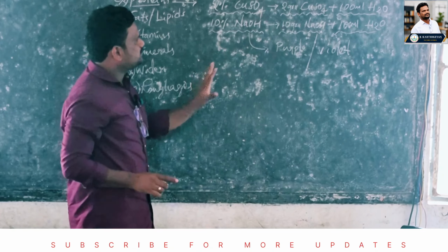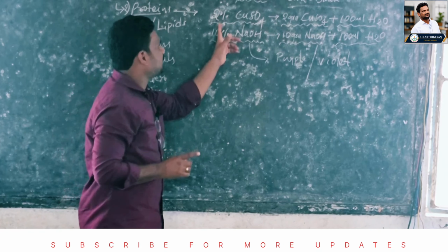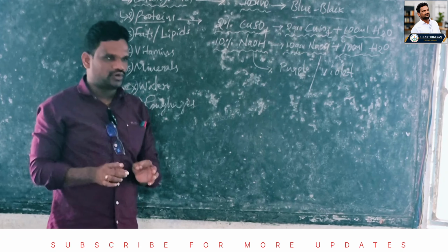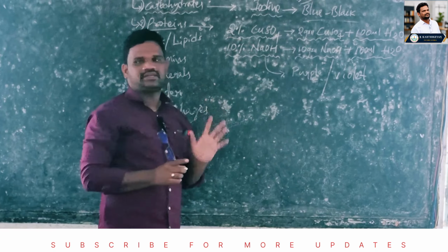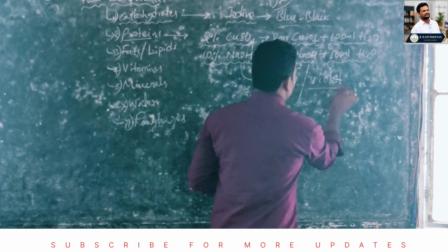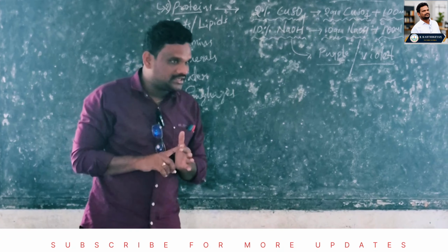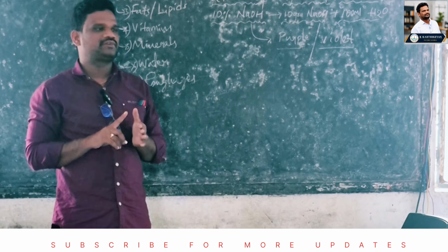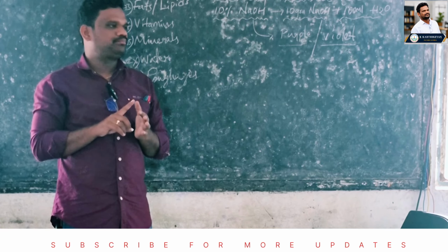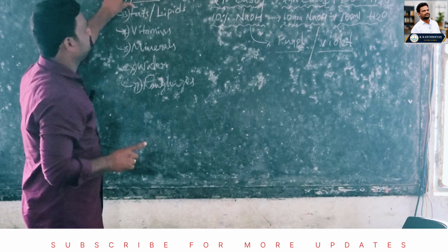Okay, now let us see what result is given by the proteins. When you add 2 drops, remember the quantity also, 2 drops of 2% CuSO4 and 10 drops of 10% NaOH to protein, then it turns into purple or violet color, which means that the food contains proteins. Which means if the food material reacts with the 2% CuSO4 and 10% NaOH, it converts into violet or purple color. Then it is an indication that the food contains proteins.